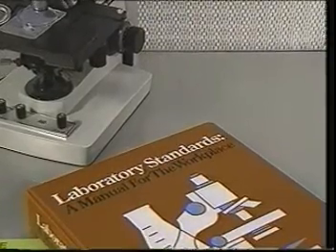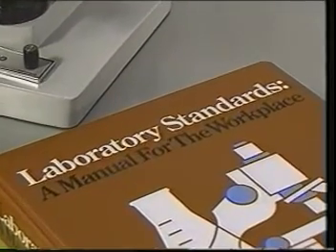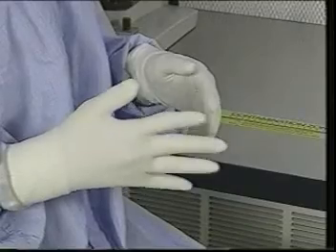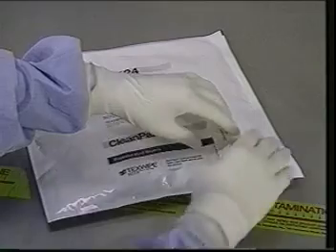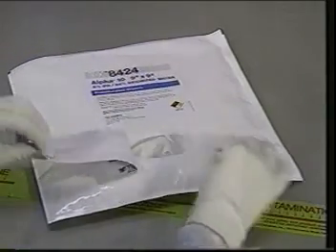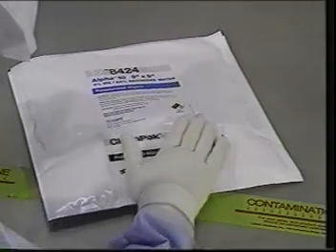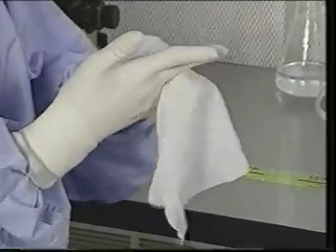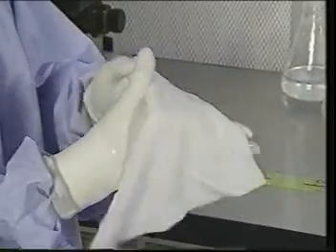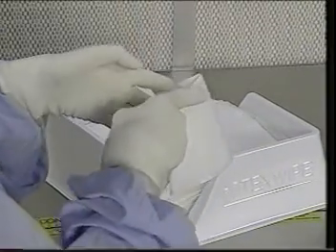Whenever you intend to use a wiper, be sure to follow the safety procedures relevant to your worksite regarding the handling and removal of contaminants. For basic surface cleaning, you'll need to wear cleanroom gloves. Make sure to wipe them off frequently so as not to transfer additional contaminants to the cleaning area. Fold the wiper into quarters. This enables it to contact the surface more efficiently while giving you several clean sides to work with.